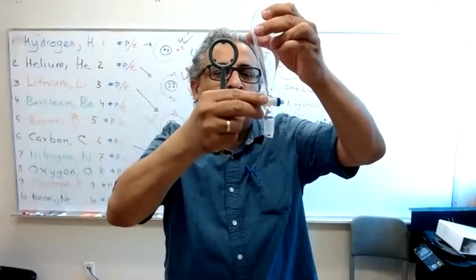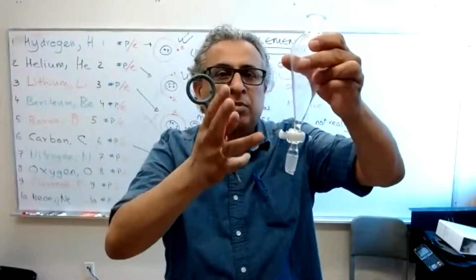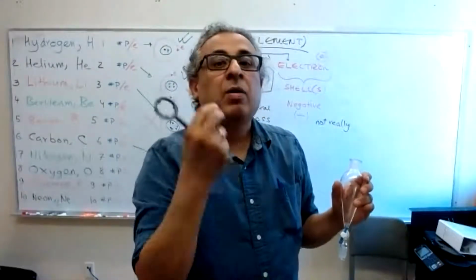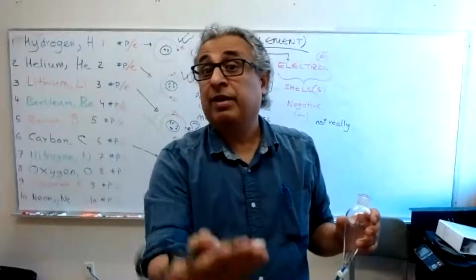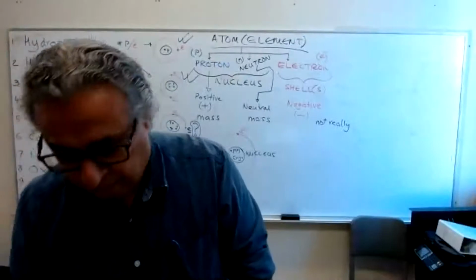Then by slowly opening the stopcock, you lower the bottom layer. Whatever the bottom layer is, whatever the top layer is, you can separate the layers. Then you can get your methylene chloride layer, the organic layer with the caffeine, get rid of the solvent, and then you have your caffeine. So this is how you can extract caffeine from water. That's one of the techniques. Okay, that's a separatory funnel.